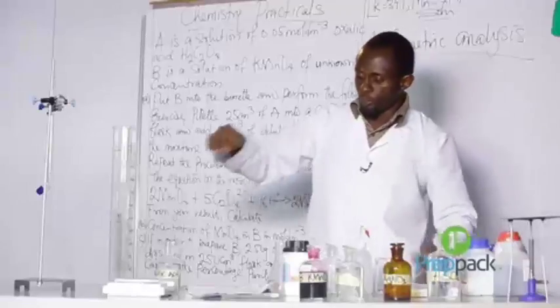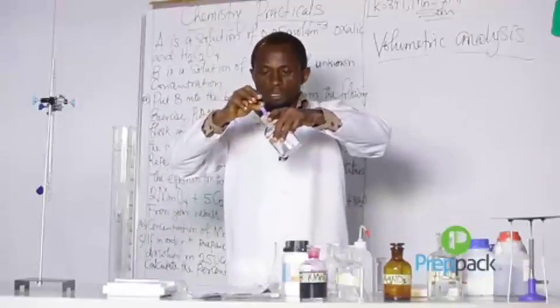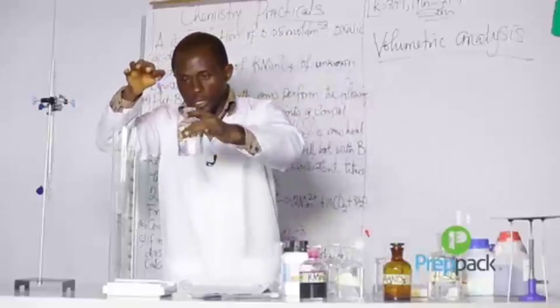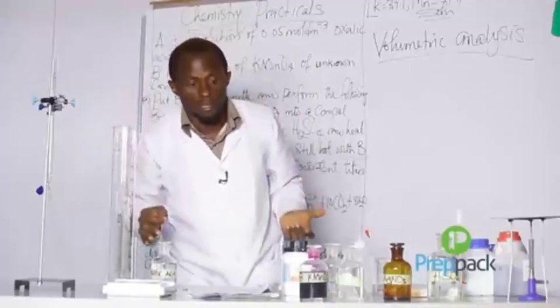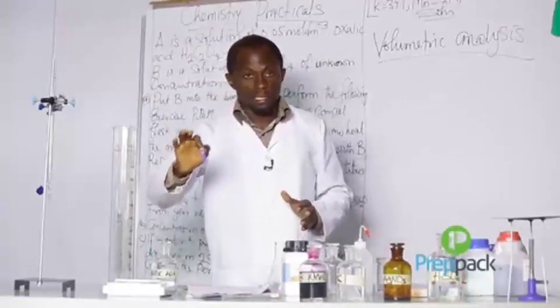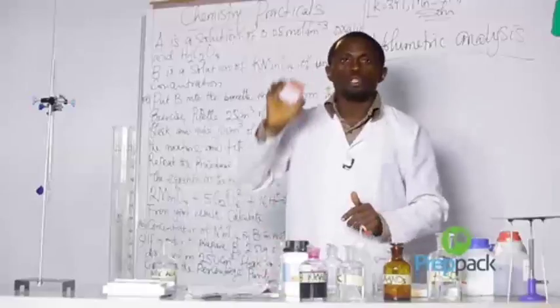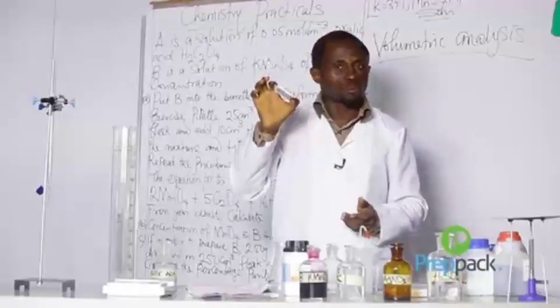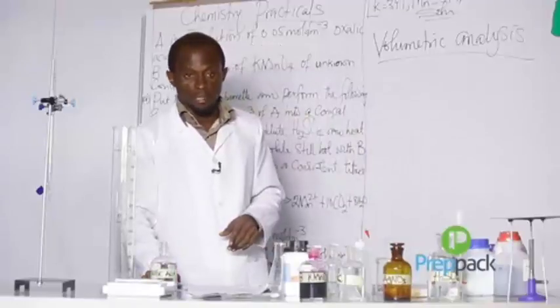It is still blue litmus paper. Then you carry out this test, take it very close to the acid. It becomes red, which is an indication that the reagent here is an acid. You can do the same for a base. Assuming the other bottle is a base, so long as this one is an acid, by turning the blue litmus paper red, I'll keep this and try a red litmus paper on other reagents. If any of the reagents turns the red litmus paper back to blue, that is an indication that that reagent is a base.